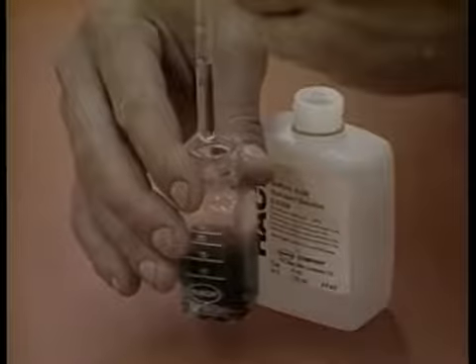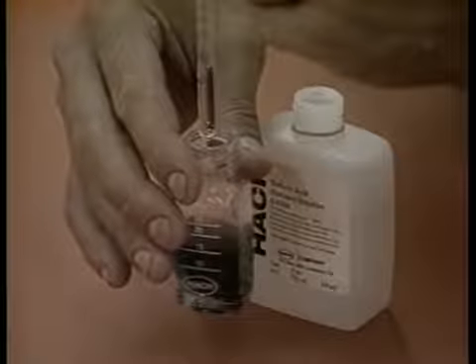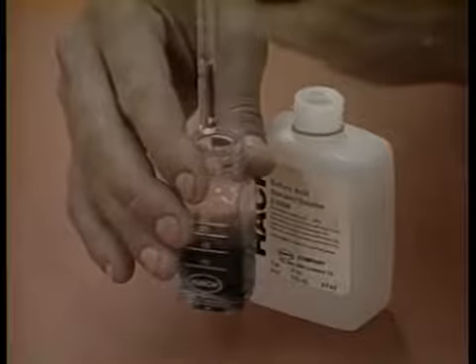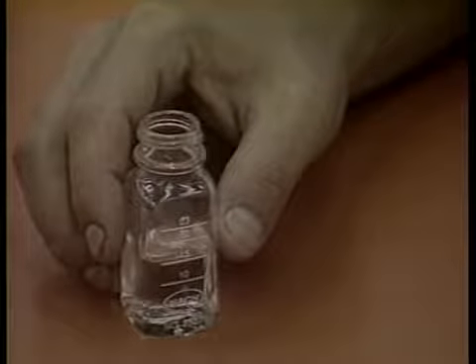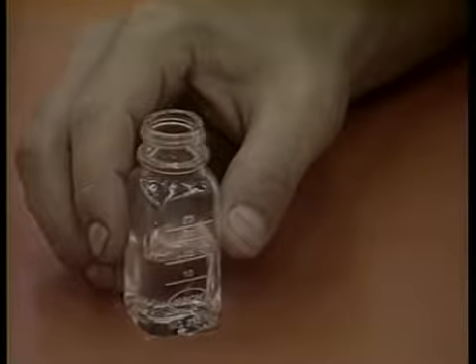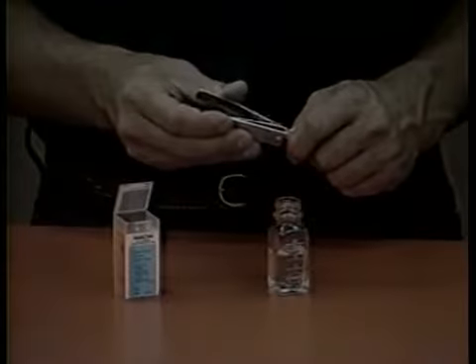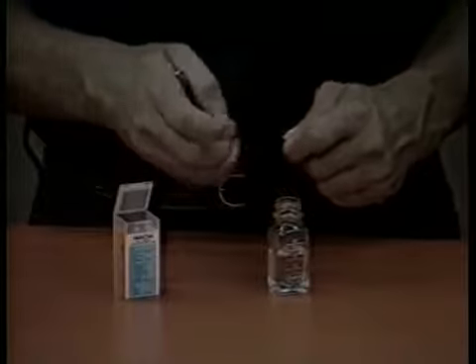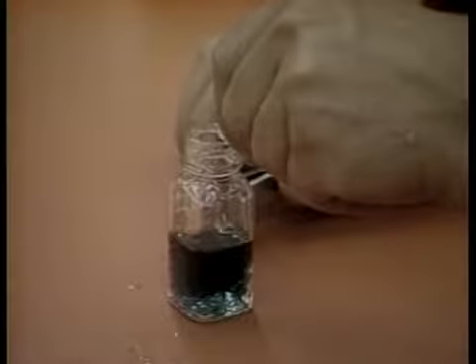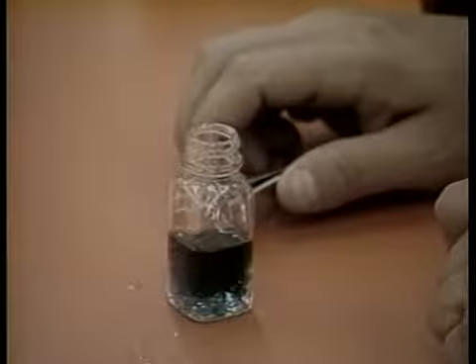If the results of the high-range test show a fairly low alkalinity, for example 1 or 2 drops or 17 to 34 milligrams per liter calcium carbonate, the low-range test should be used for greater accuracy. The low-range test is identical to the high-range test, except in this case the sample size is increased, thereby resulting in greater sensitivity due to the lower concentration of indicator which is present. In other words, the indicators that are added in the low-range test are diluted more than they are in the high-range test. The greater sensitivity in the low-range test results because more drops of sulfuric acid must be added to the same water sample in the low-range test than in the high-range test.